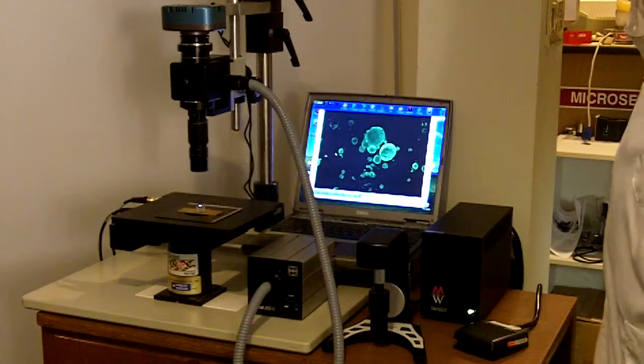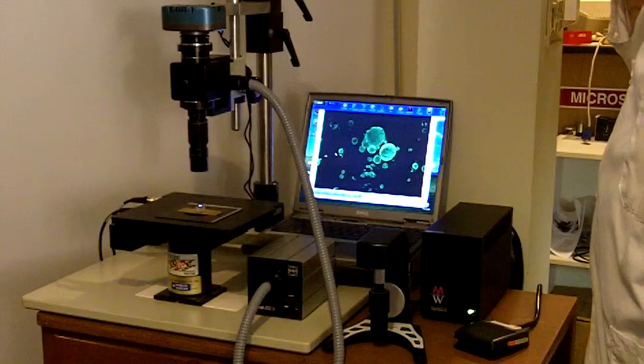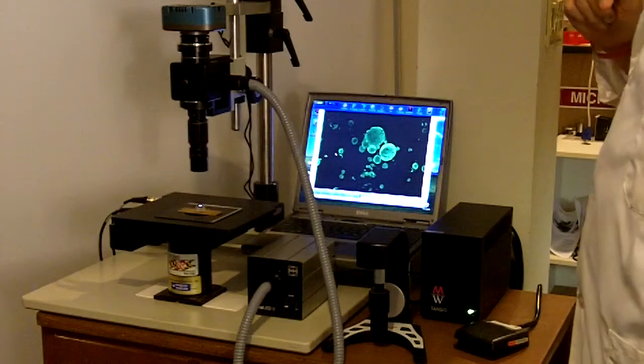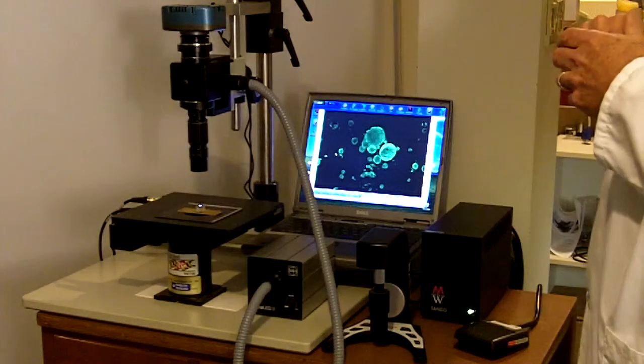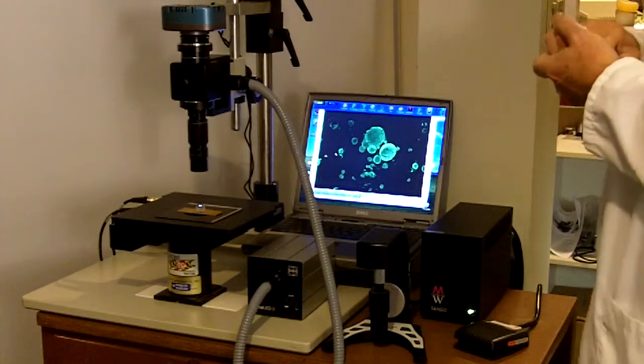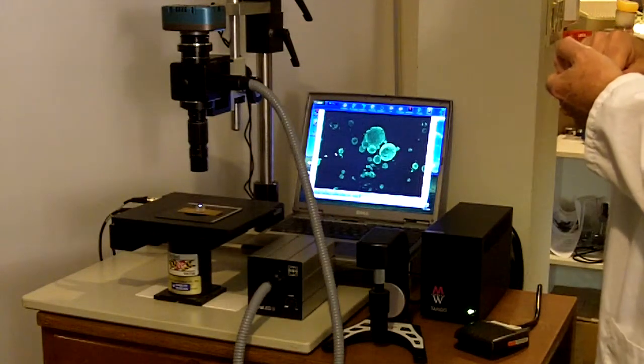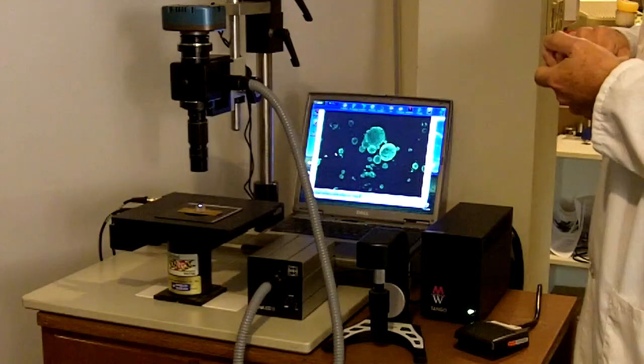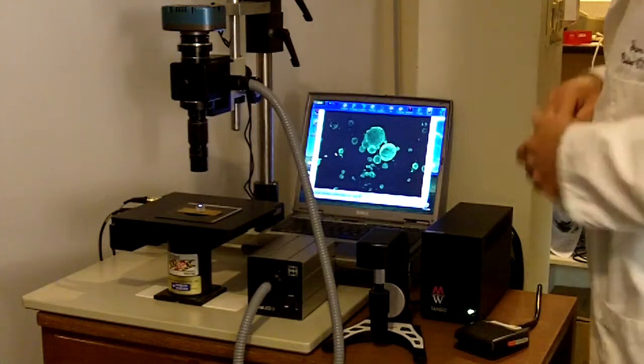So again, we call this Retrofloor. It's designed as a modular fluorescence macro micro system. And it will do things that far more expensive stereomicroscopes from the major microscope makers will find nearly impossible, if not totally impossible to equate. So thank you for your time and I hope you enjoyed hearing about this brand new product called Retrofloor. Thank you.